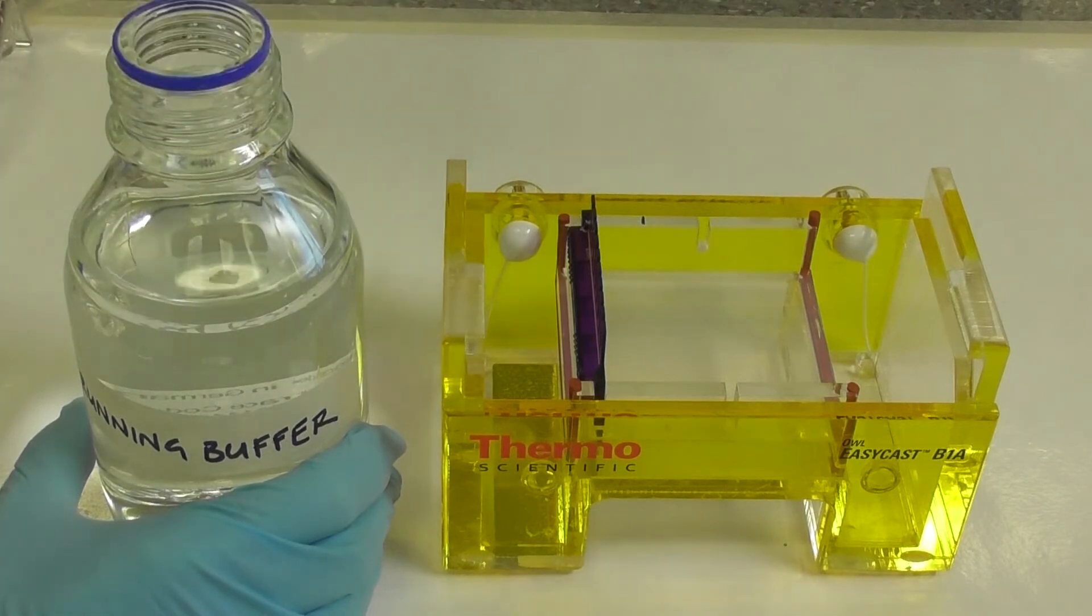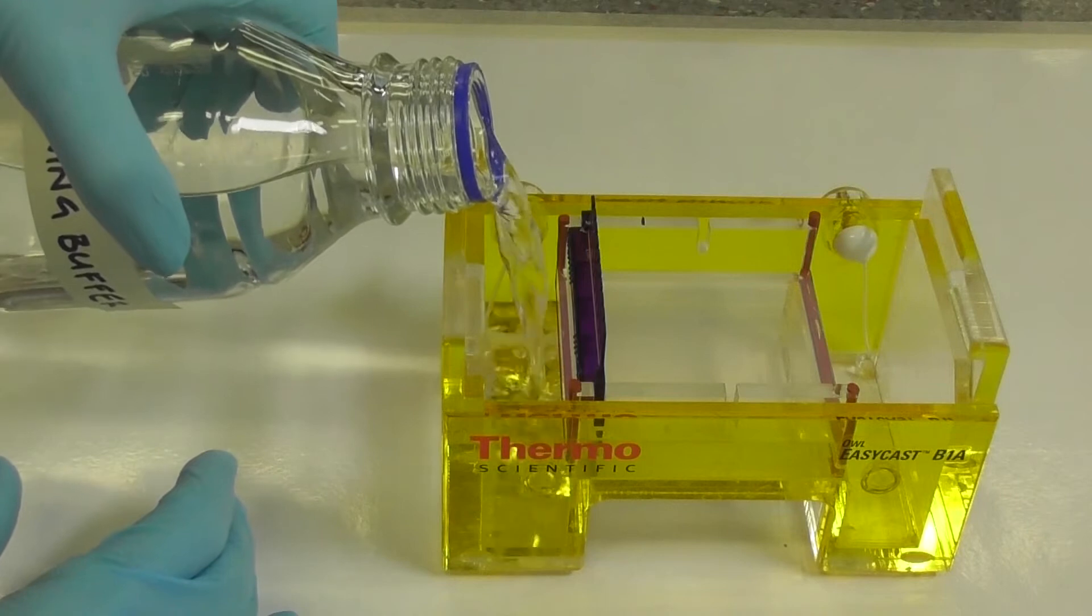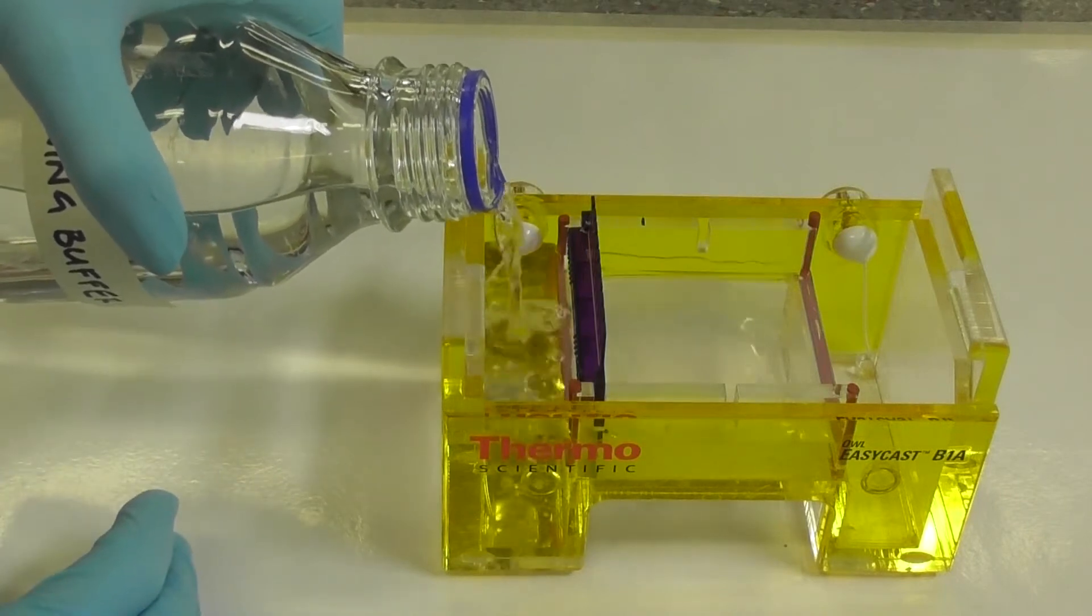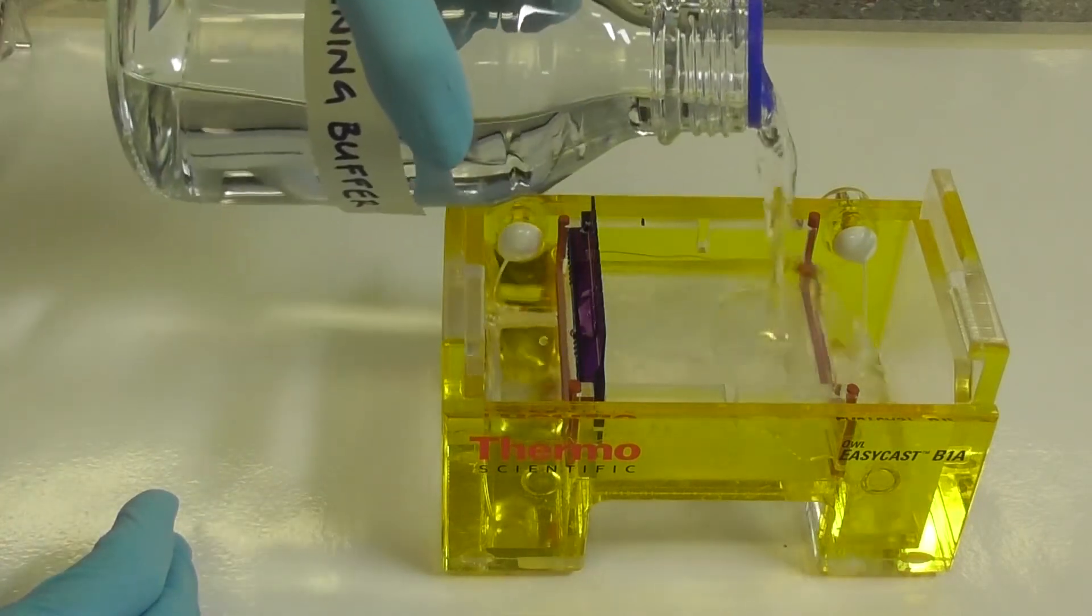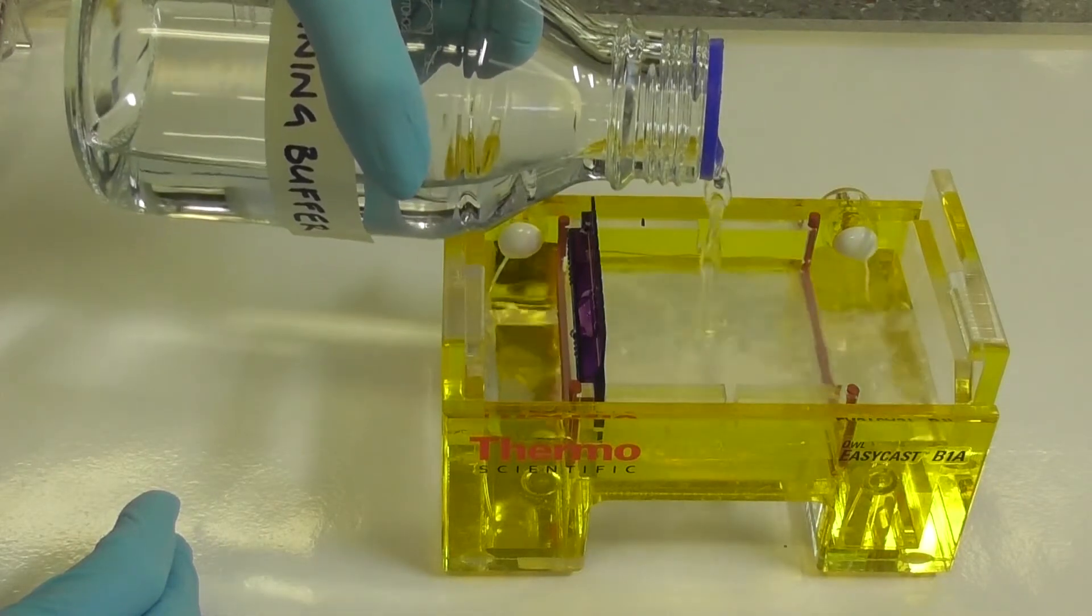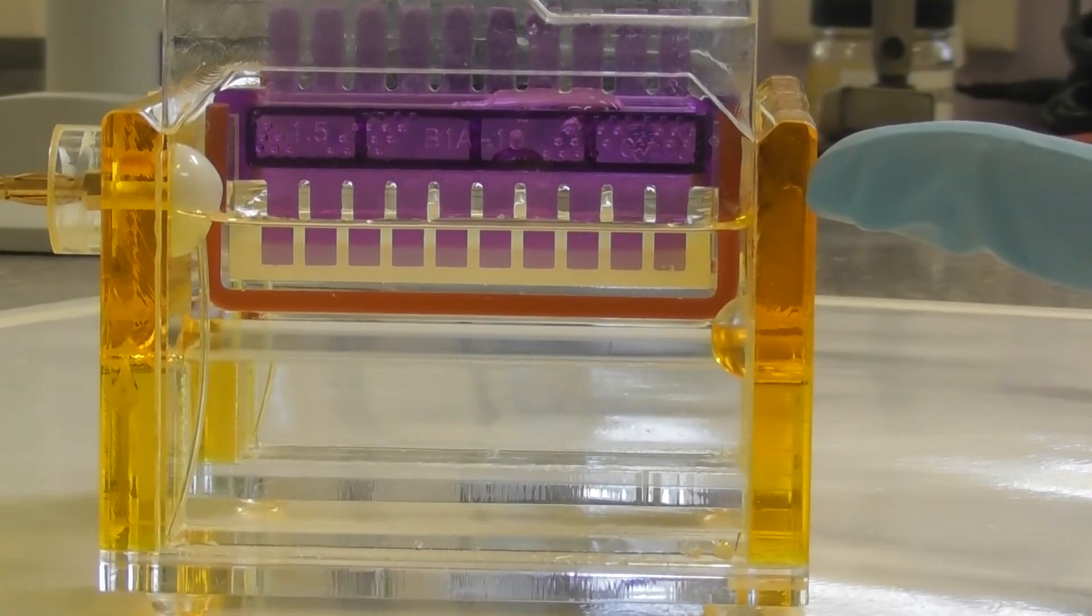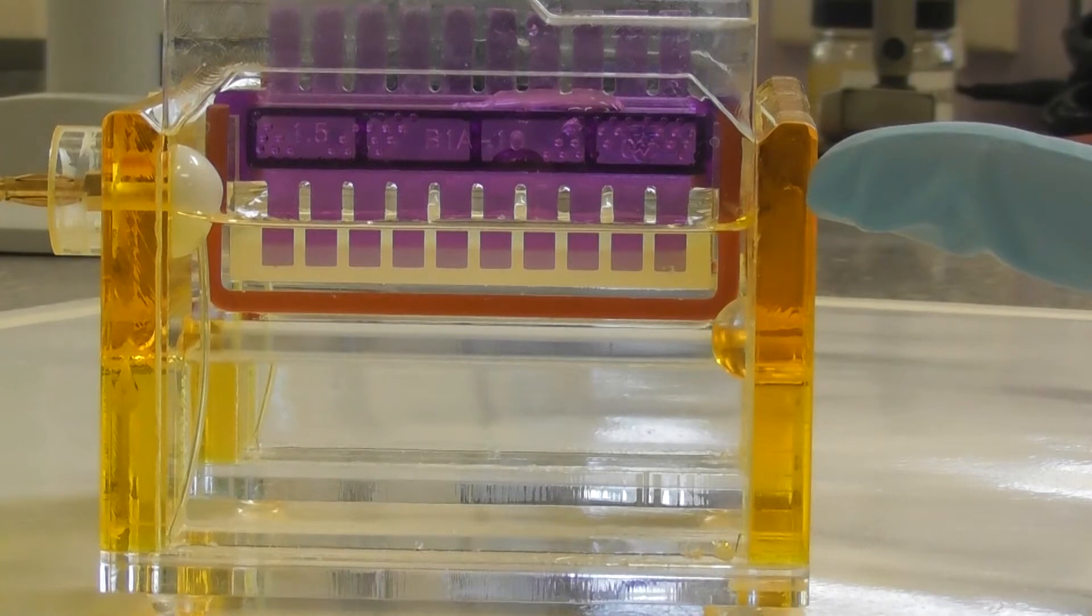Fill the gel tank with a running buffer. Start by pouring buffer in one end of the gel tank until it is full, and then complete filling by pouring over the gel and into the other end of the gel tank. A good level to fill the gel tank to is approximately the same coverage of buffer above the gel as is equivalent to the thickness of the gel, as pointed to here.